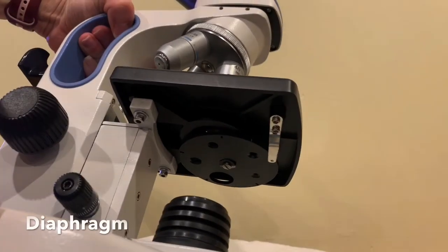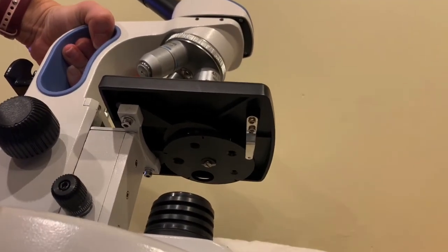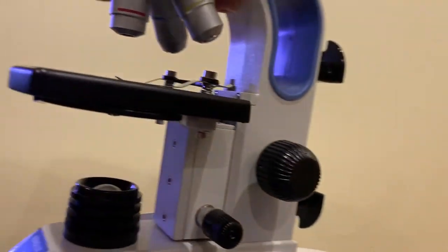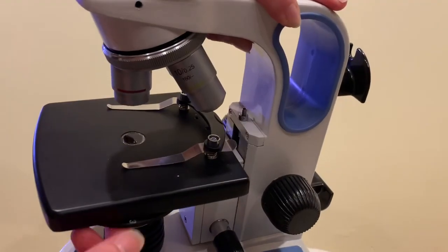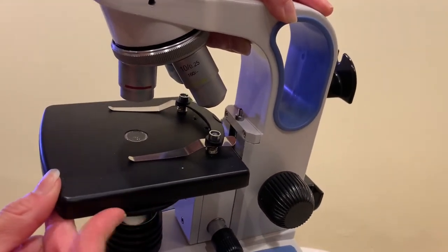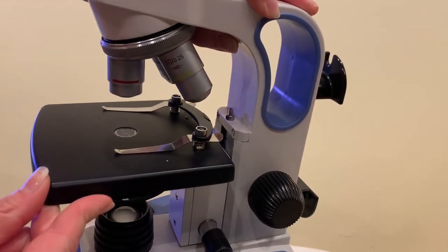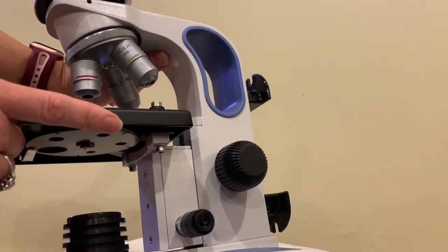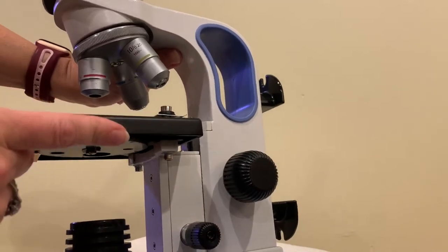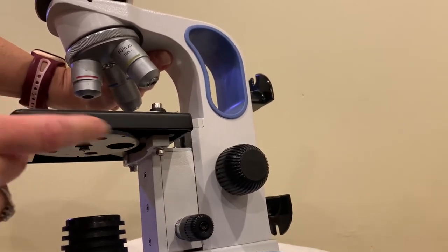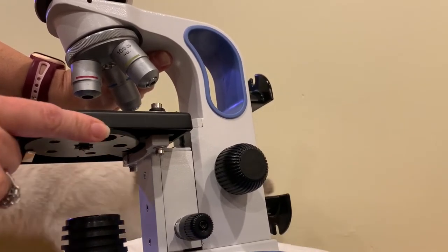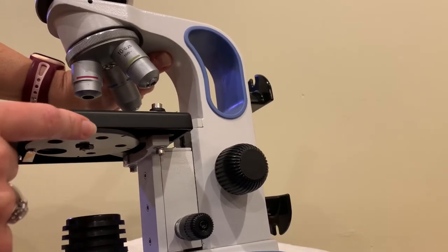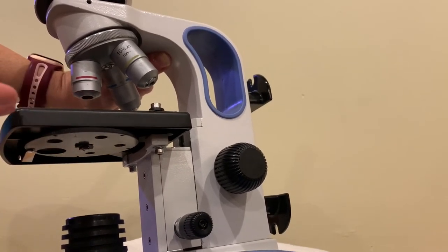Next we have the diaphragm. So the diaphragm is kind of under here and from this side, here you can see there are some numbers three two one. Underneath you will see five holes of different diameters. The diaphragm is used to vary the light that passes through the stage opening and helps to adjust both the contrast and resolution of a specimen. So you can rotate the diaphragm based upon whatever your sample looks like if you think you need a little more light or a little less light.